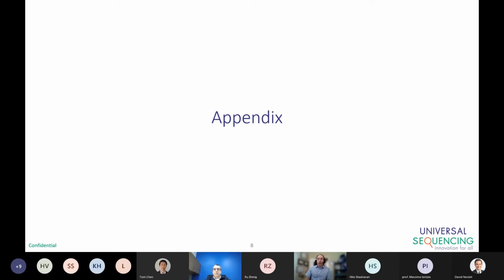Okay, so a whole bunch of questions. We presented phasing of targeted amplicons. We actually first rolled out phasing at the genome scale. So the second question, how much DNA is needed to prepare the library? We went over how much is needed for the amplicons. For the genomic DNA, it was also quickly on that slide. If you're looking at a larger genome, such as a human genome, we're talking 5 nanograms of DNA. For a microbial whole genome, you'd be looking at about half a nanogram of DNA.